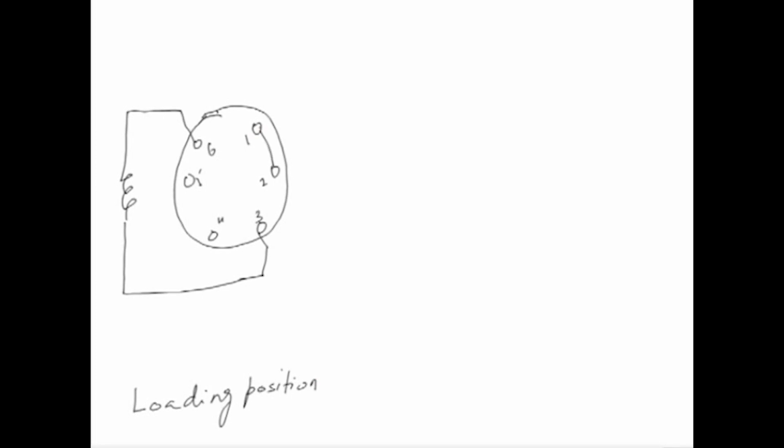The configuration is that you have the eluent, or the mobile phase, from the pump going to port number 1, and from port number 2 it is going to the column. So, still you have not loaded. Now this is the loading position where you can load your sample. If I say this is your knob which has to be shifted, then this is the loading position, and this is your loop, which is of fixed volume.